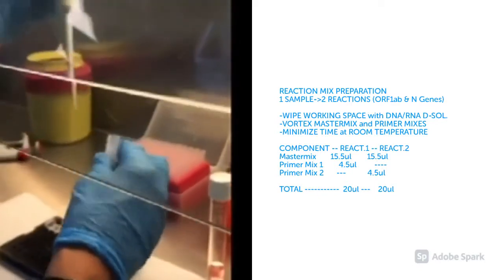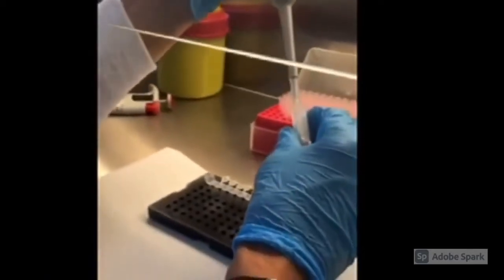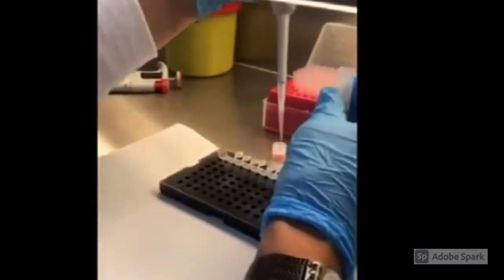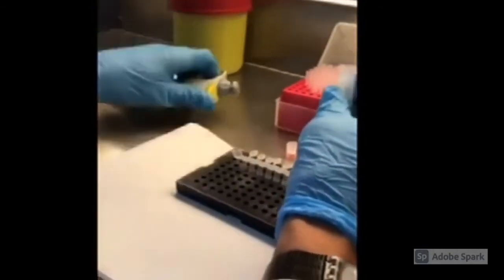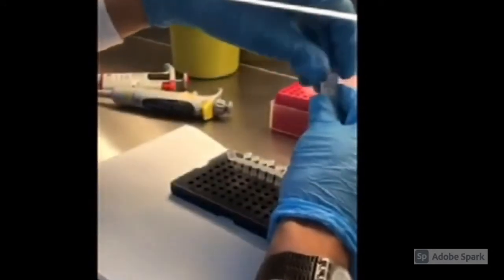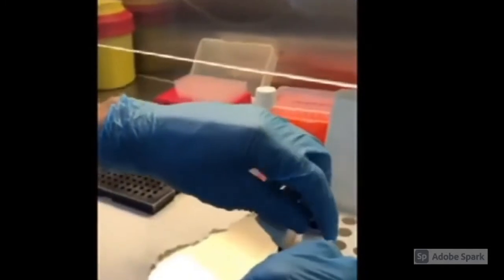And first of all, for the first tube, we put 15.5 to the first one, and 15.5 to the second one. And then our master mix is ready. This is our RT master mix is ready.